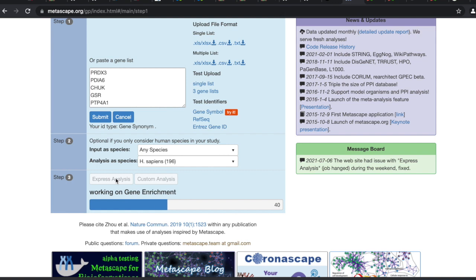Metascape isn't too bad. It's better than DAVID — just about everything's better than DAVID. It might take a little while, but what this will do at the very end is give you basically a summary on the gene list that you put in.